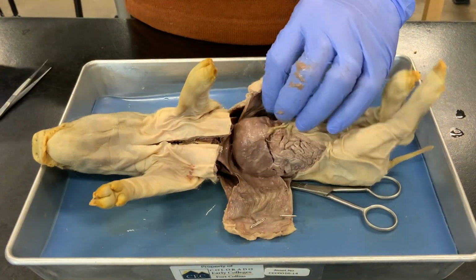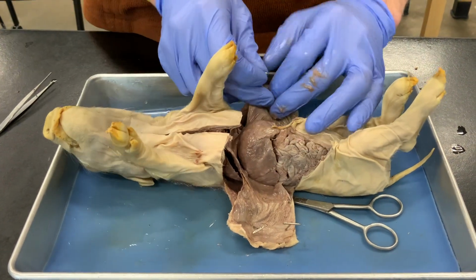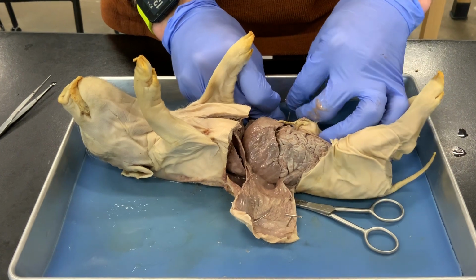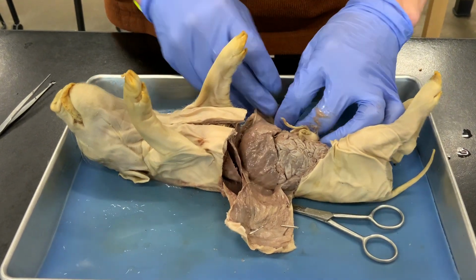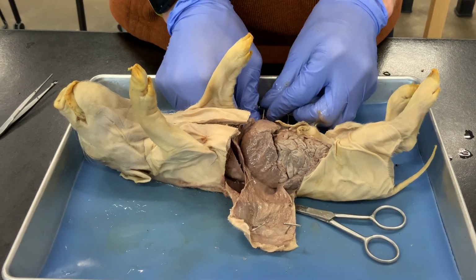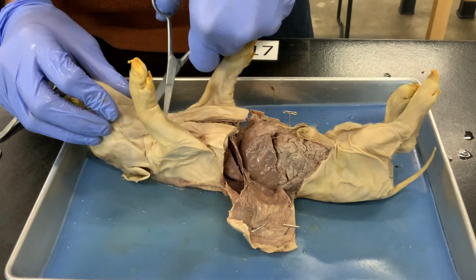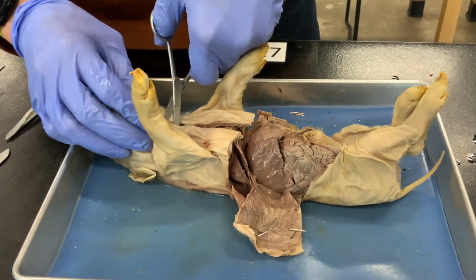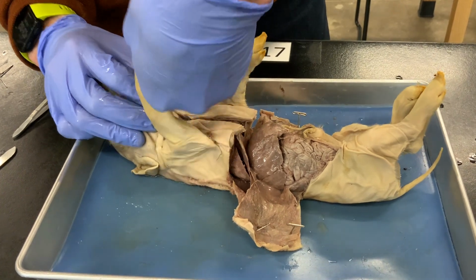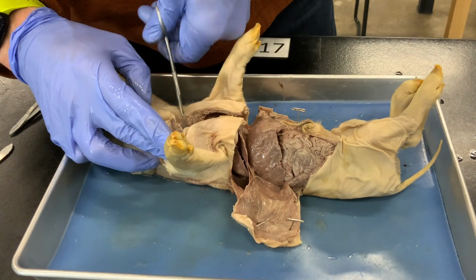We'll start to look at the same organs and look at a couple of differences from the frog. Secondary cuts at the front of the thoracic cavity so that we can open that as well.